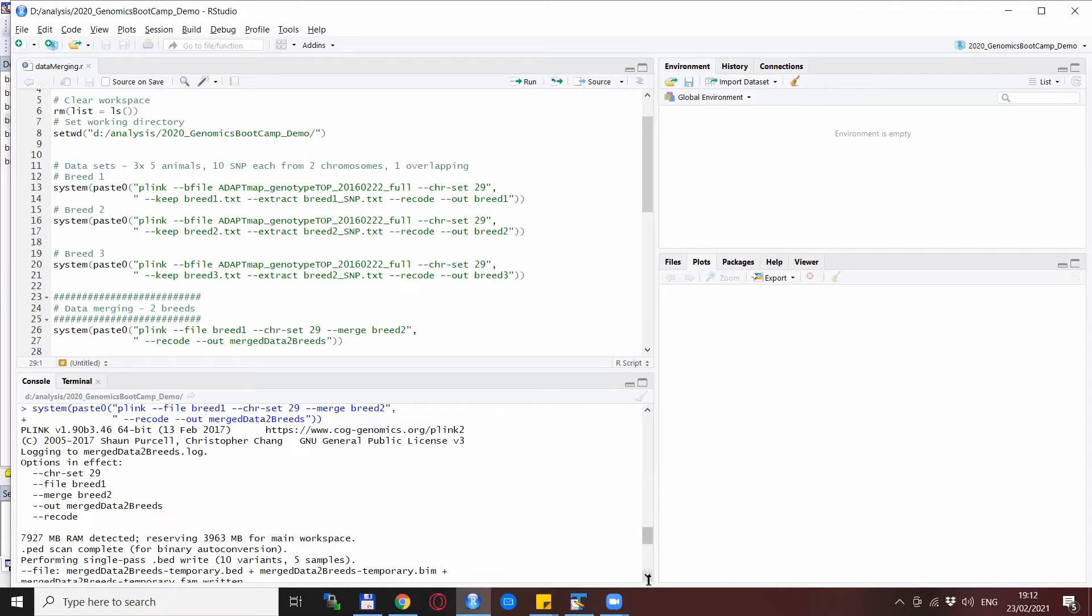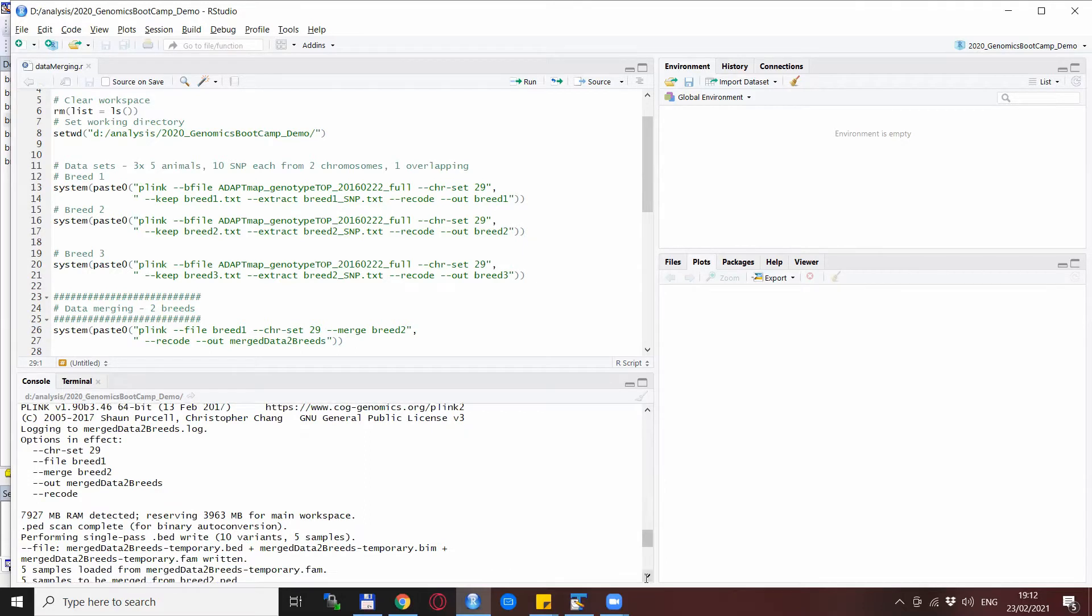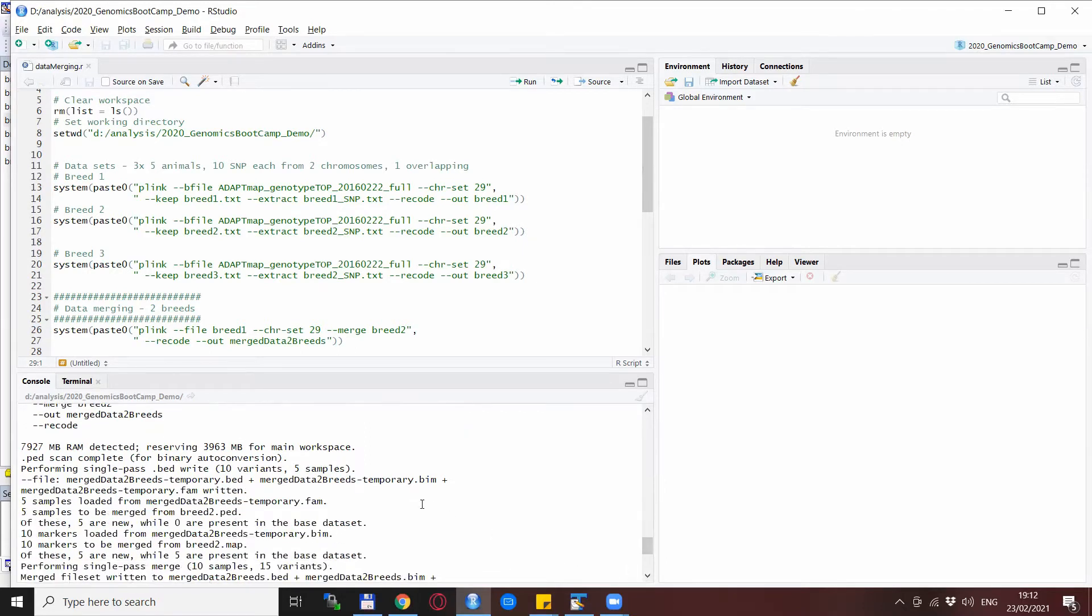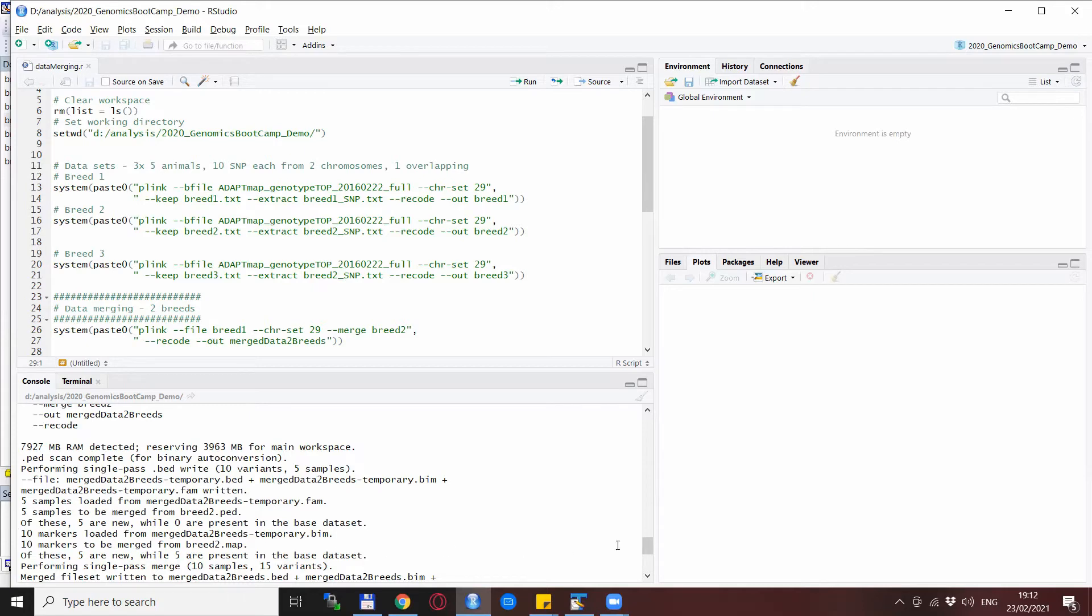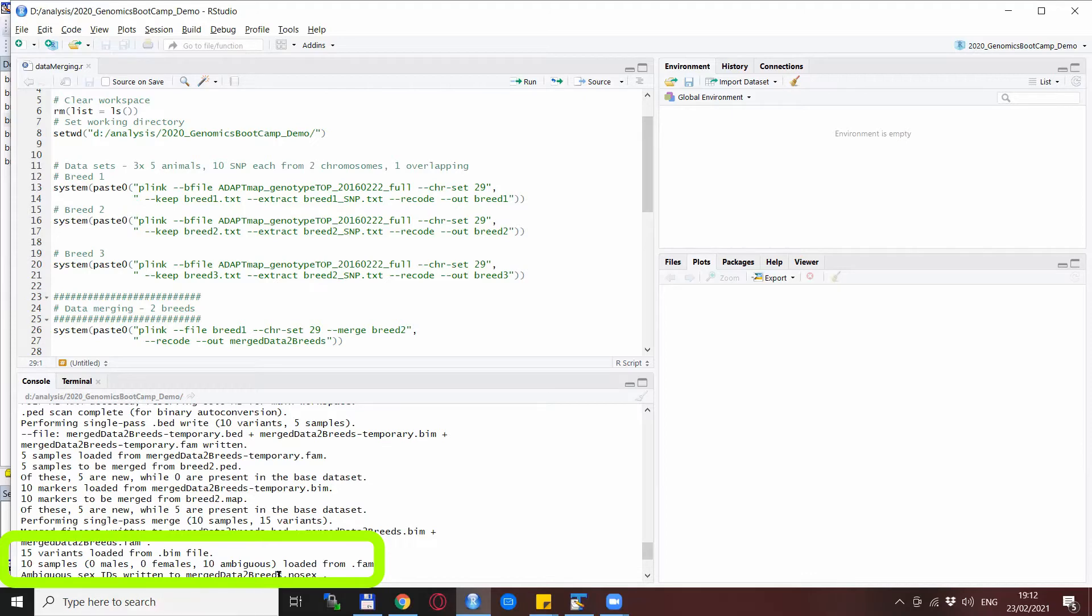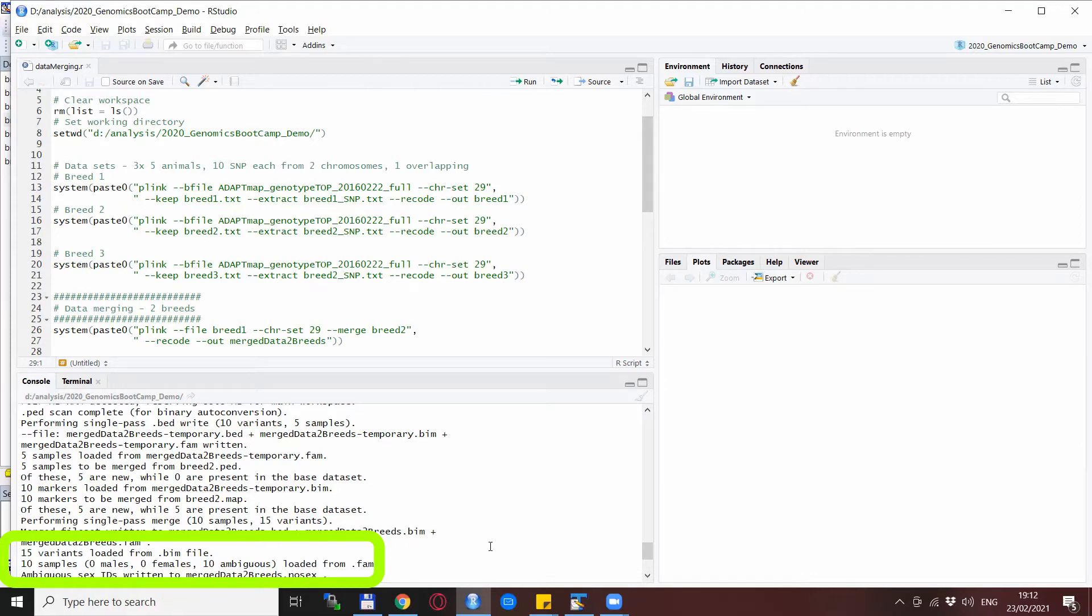So you see that we had five samples from each dataset, 10 markers from each of the two, and the merged dataset has 15 variants and 10 samples in total. And this is how the output merged file looks like.